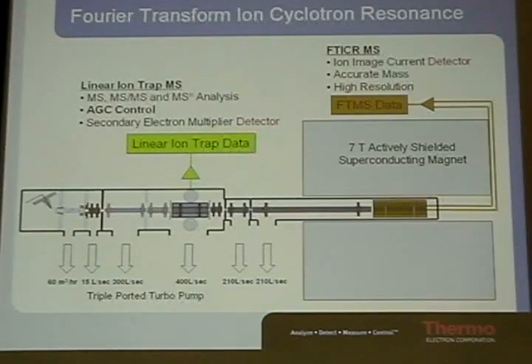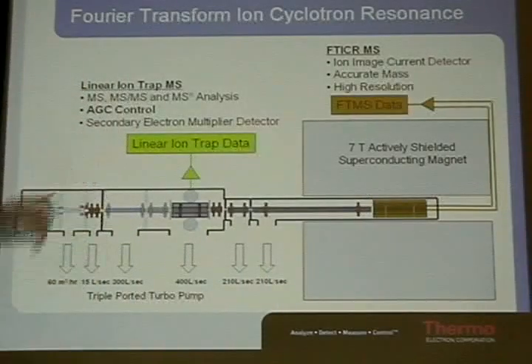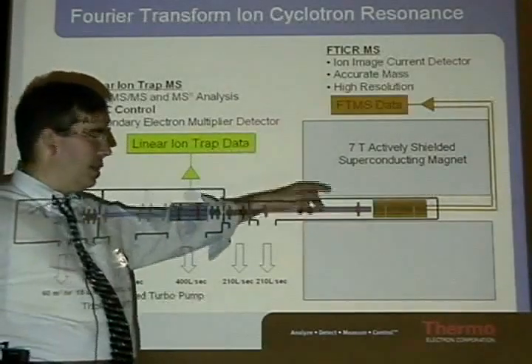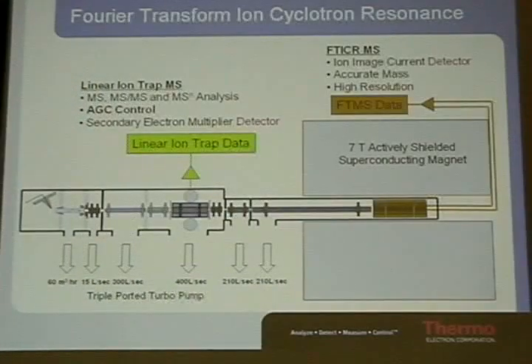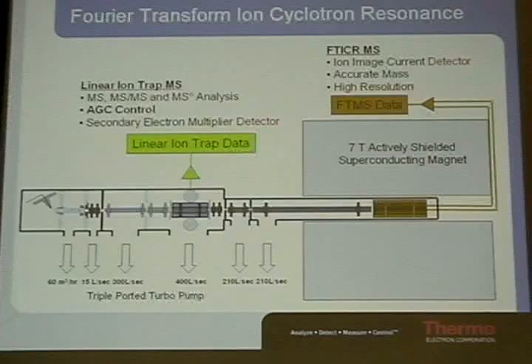So it's spacious enough to avoid space charge. Right, and the key is these end caps have resistive wiring. When you look at this thing in the picture, you think there should be about 12 wires going to it. There's actually about 50 wires going to it for the resistive coupling to make it more infinity-like. This sits inside a 7 Tesla actively shielded magnet, which you obviously have to fill with cryogens to keep it cold. If you guys have any questions on magnet technology or supercon, let me know, if it's not intuitively obvious. And no, it is not plugged into the wall.